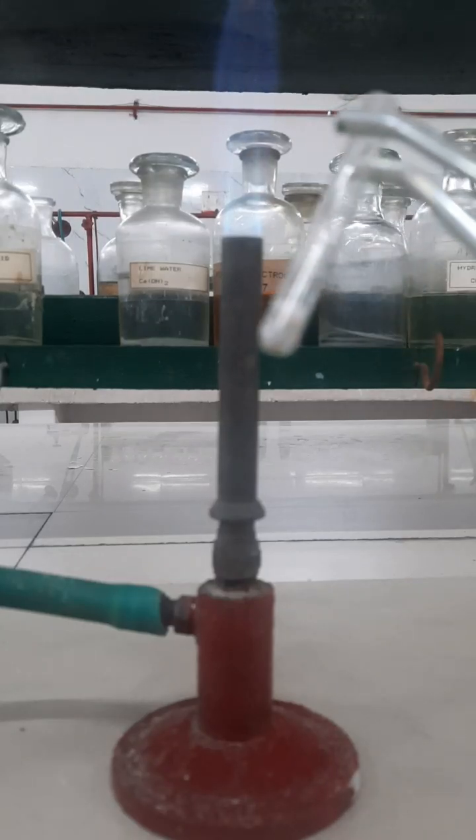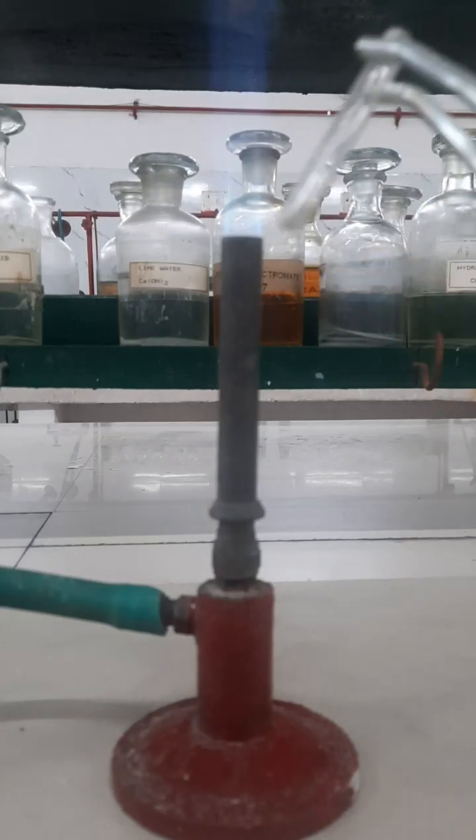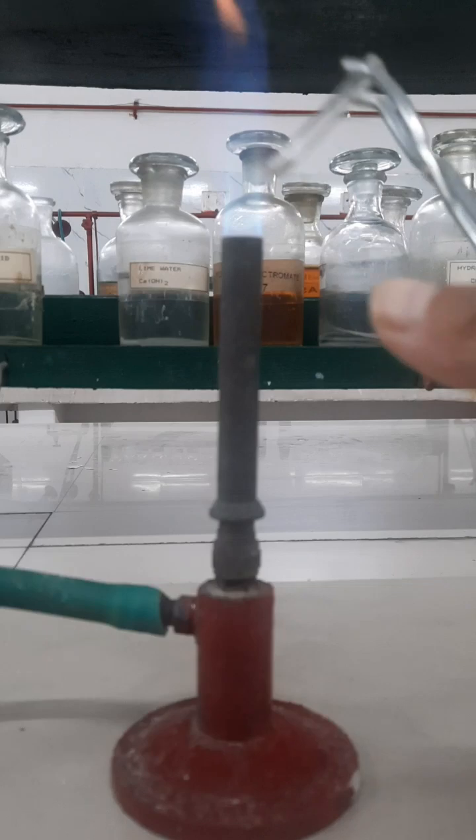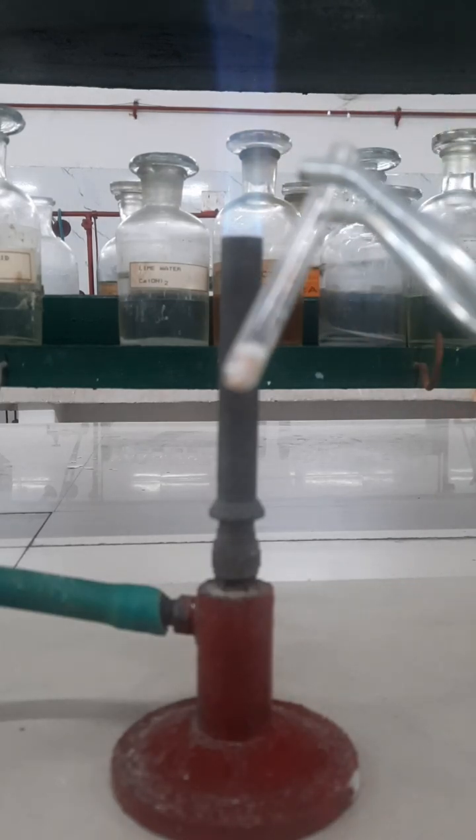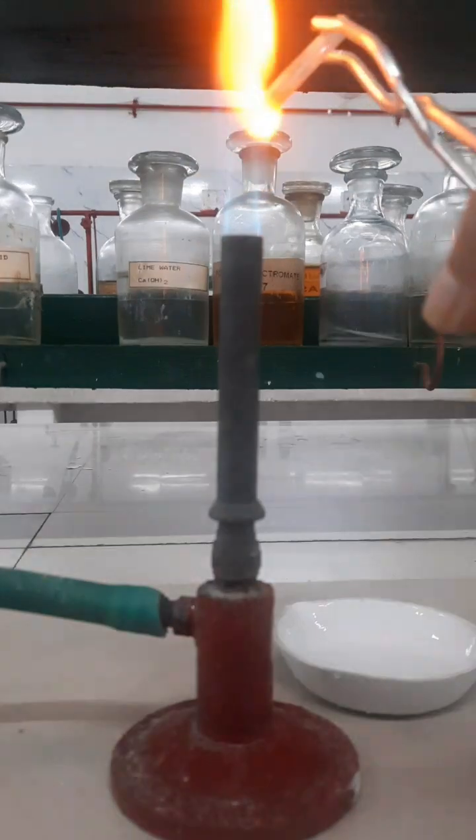Let's prepare a sodium fusion extract of thiourea. I have taken a small piece of sodium metal and thiourea in the ignition tube. First, I am heating gently such that the sodium metal melts and fuses with the thiourea.